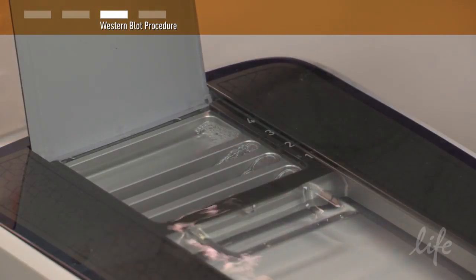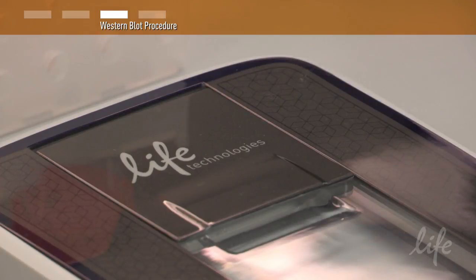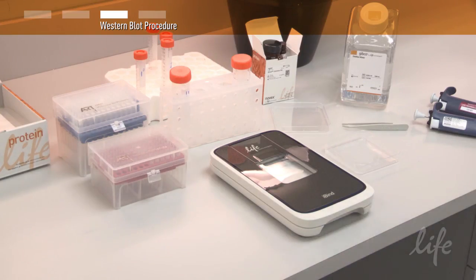Then close the well lid of the iBind device and incubate for at least two and a half hours. You can even leave it overnight.